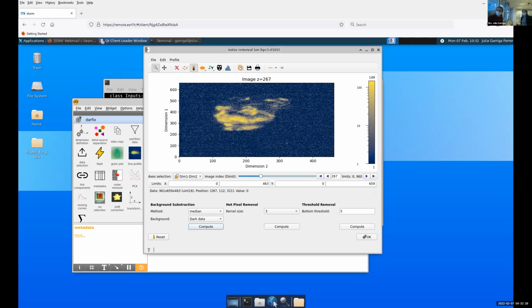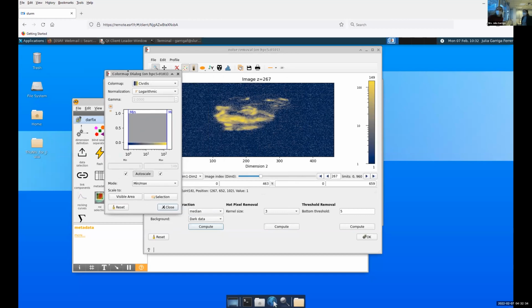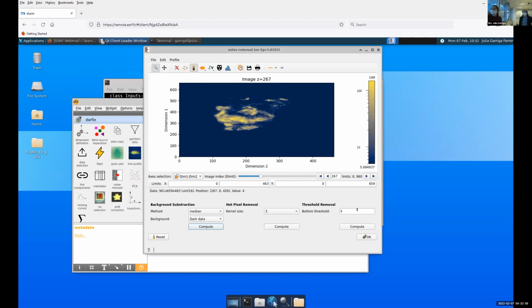What I use as a cheat sheet is the palette of colors. You can scroll up in your bar, remove the auto scale, and see when your pixels start disappearing. You also pay attention to the grain to see that the information from the grain is not being lost. Exactly. So here we could put 6. I think six should be a good compromise.